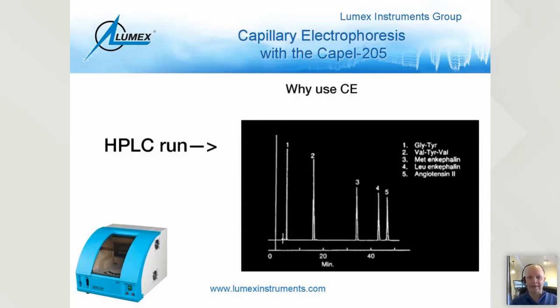I'm very enthusiastic about CE. I've been working with CE for like 23 years, believe it or not, and I had a little bit more hair at the time. Anyways, this is why you should be using capillary electrophoresis for certain of your applications.